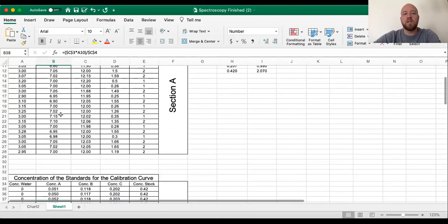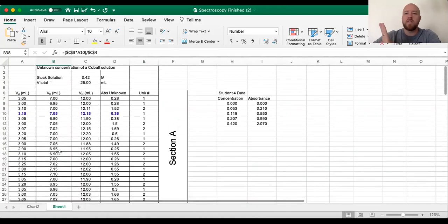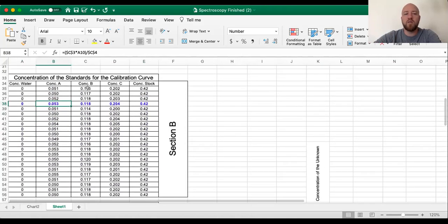So this is a calculation of this volume and the initial concentration. It's not really important to you. How they get this is not really important at this point. But the point is these are similar to those percentage values from the physical properties lab. So as we had percentages, now we have concentrations in molarity.